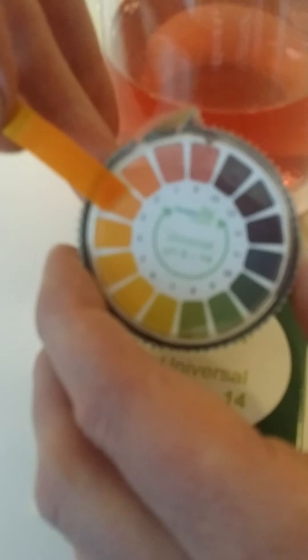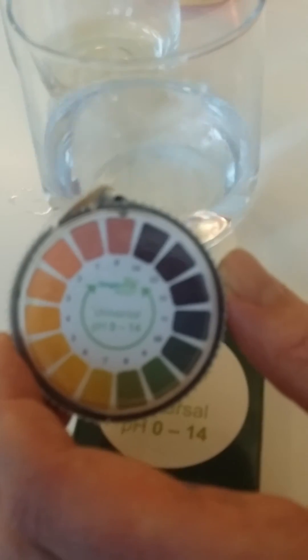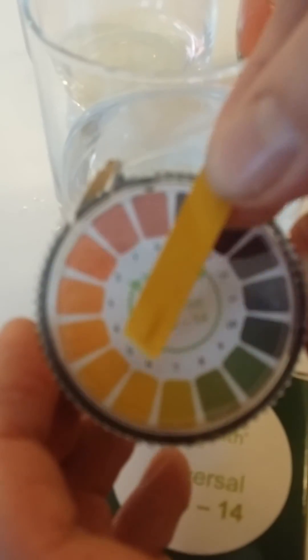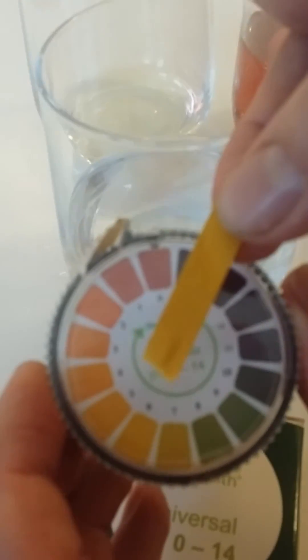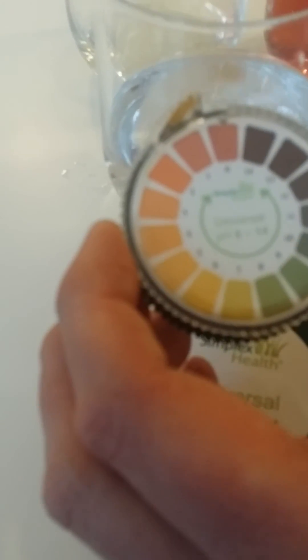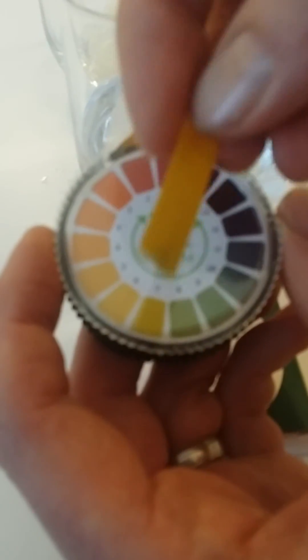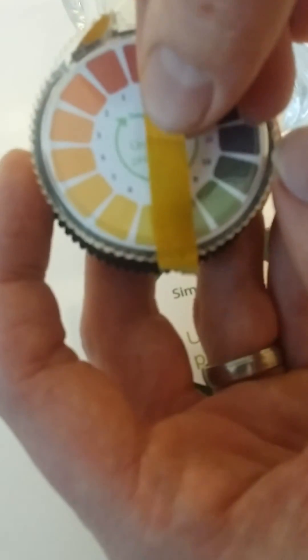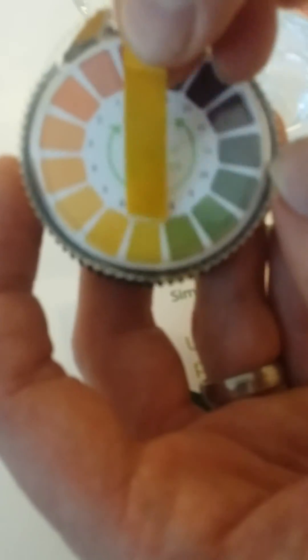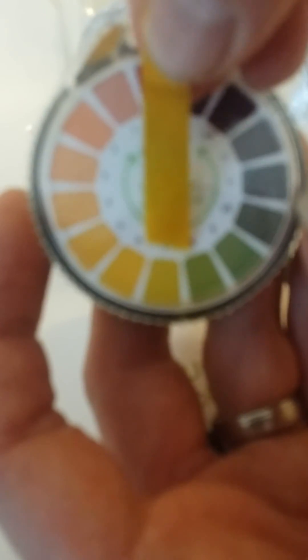We'd match that to the number 3, so you'd say that's a pH of about 3. And then the final test we're going to do is tap water. Tap water usually has a pH of about 7, and because these strips are already relatively orange you'll probably find that the strip won't change drastically. Then you'll know the pH is around 6 or 7. When I dip it in and take it out, it's got a slight hint of green to it, so that means when we match it against the chart the pH will be about 7.